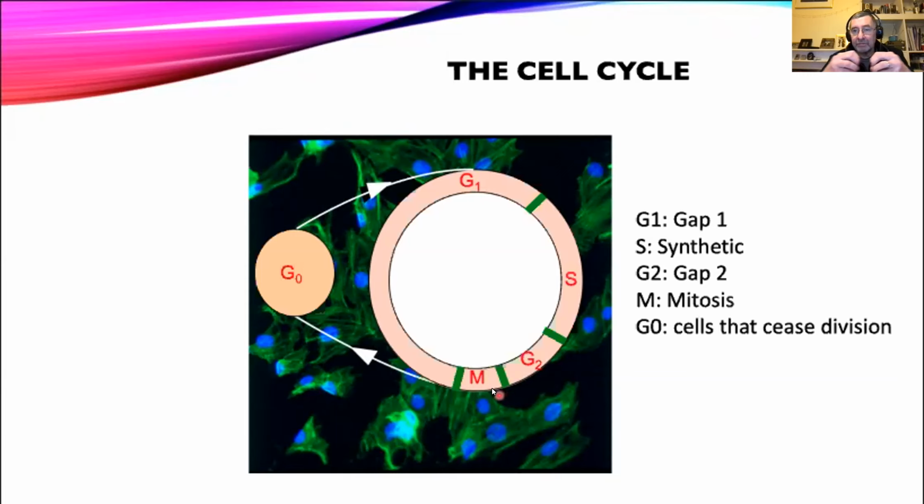And of course, then we get division, and we get two daughter cells that now take half of that doubled amount of DNA and either go back to a resting state if the repair of your paper cut is finished, or more likely, if you're using cell lines, those cells will go back into G1, ready to divide again.